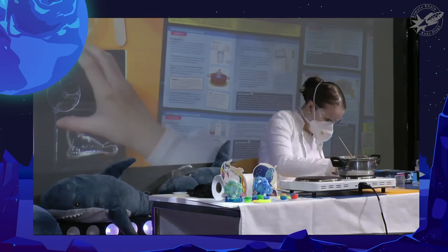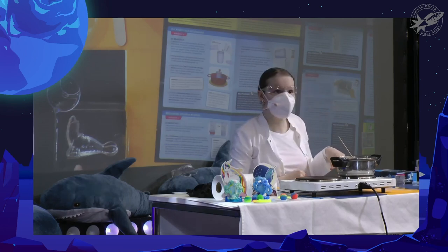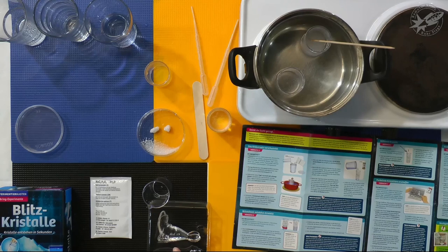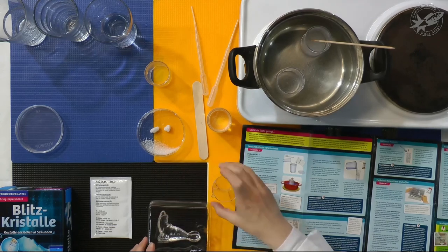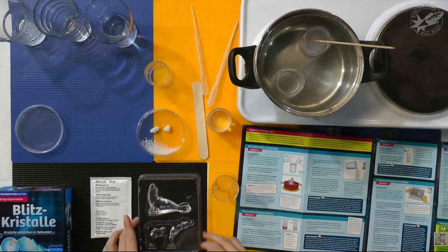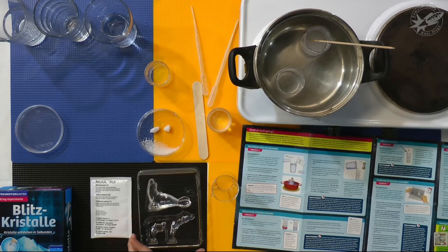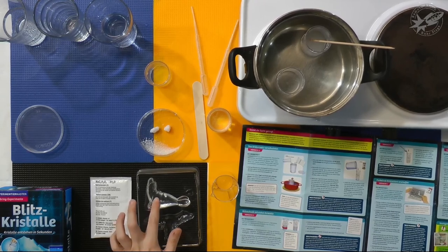Lass ich das auch abkühlen und man sieht sofort, es bilden sich hier Kristalle. And then I'll let this cool down. You can see that it's already starting to form crystals on the surface. It is not very easy to see. We can already see some skin forming.